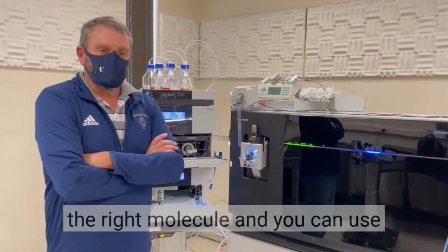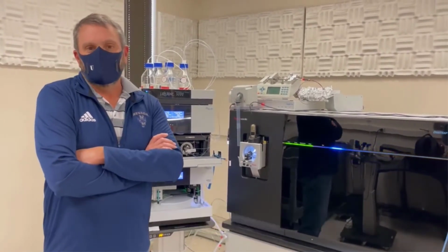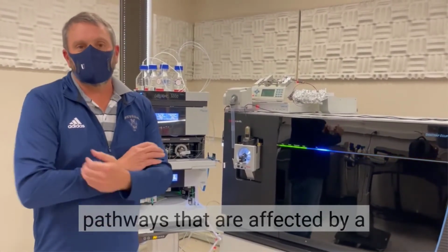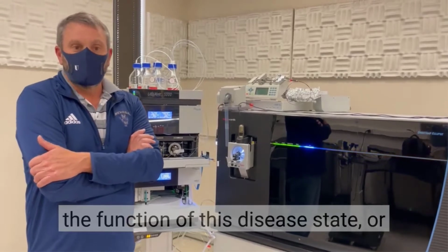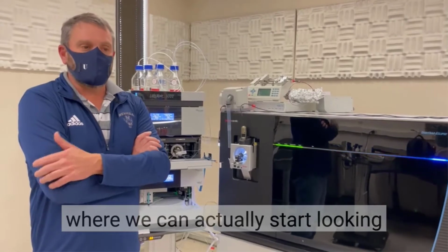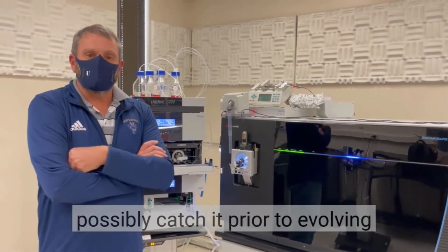And you can use it, in our case, for proteomics, where we are identifying and quantitating proteins in certain disease states. This allows us to determine pathways that are affected by a certain disease state, and possible modifications to proteins that affect the function of this disease state. Or also, we can do biomarker discovery, where we can start looking at a clinical approach for markers for a certain disease state and possibly catch it prior to evolving.